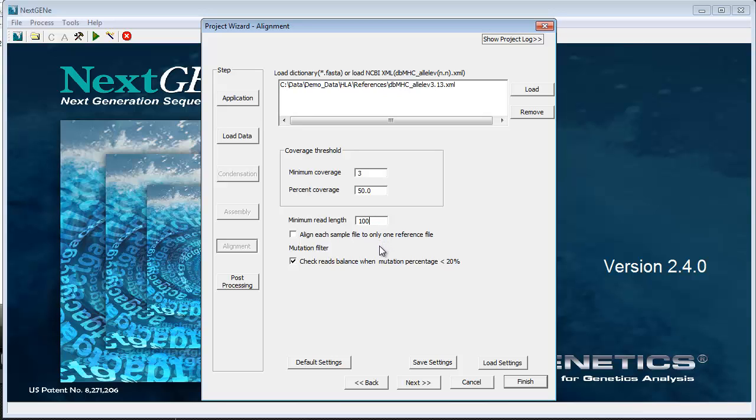Align each sample file to only one reference file. Certain chemistries can produce a separate sample file for each gene sequenced. Select this option if this is the case for your sample data.